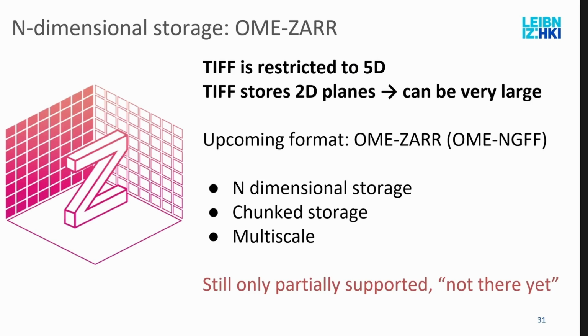And as a heads up, you will encounter this at some point, which is why I mentioned it: the OME-Zarr format. It's the same people who are behind OME-TIFF, the standardized TIFF format for microscopy. The OME-TIFF format is designed for 5-dimensional images only, and when you have additional dimensions, you run into problems with it. This is why the people designed this OME-Zarr format, basically as a replacement for it.